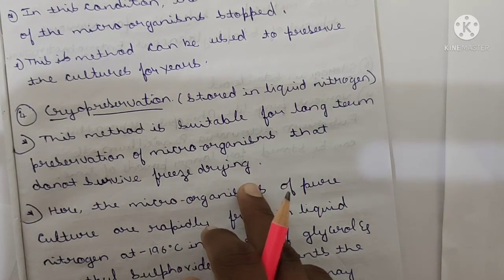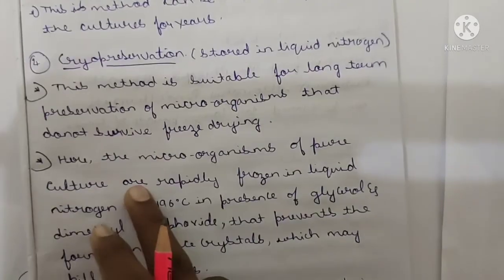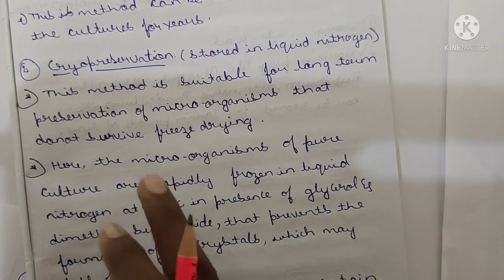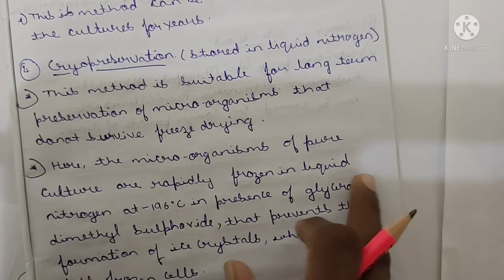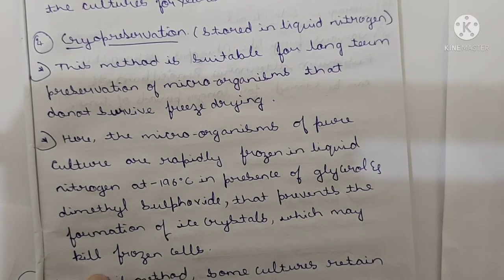Here the microorganisms of the pure culture are rapidly frozen in liquid nitrogen at minus 196 degrees Celsius in the presence of glycerol and dimethyl sulfoxide. These prevent the formation of ice crystals which may kill frozen cells.